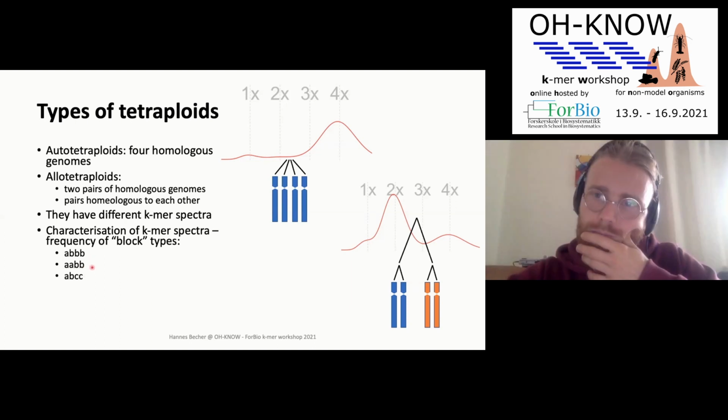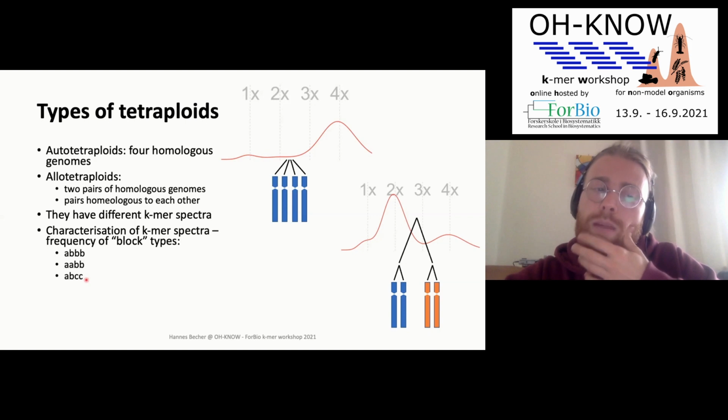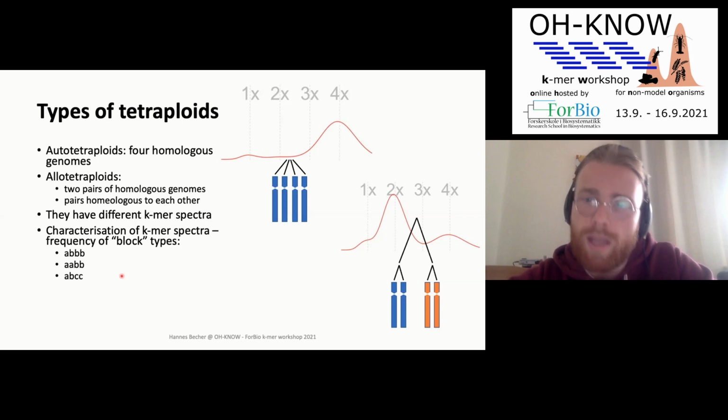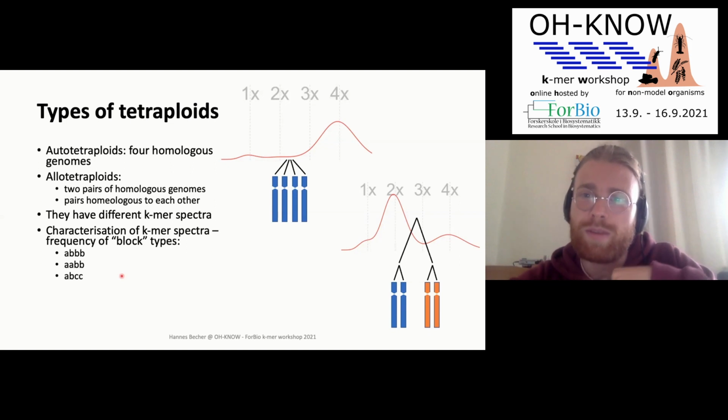I feel GenomeScope doesn't really string them together. GenomeScope doesn't really know if theta is this, I expect this percentage here and that percentage there. Yeah, it's interlinking it with duplications. So it's assuming the duplications and heterozygosities are randomly overlapping. So I think that's where it's getting statistical power to fit them all.